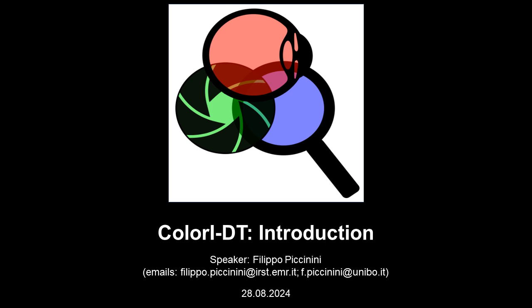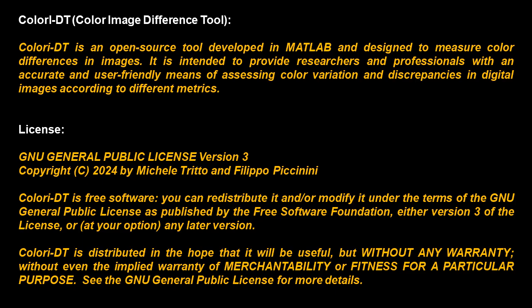Good morning to everyone. This is the first video tutorial about ColorI DT, an open source software tool we developed using MATLAB. ColorI DT stands for Color Image Difference Tool and is an open source tool developed in MATLAB and designed to measure color differences in images.